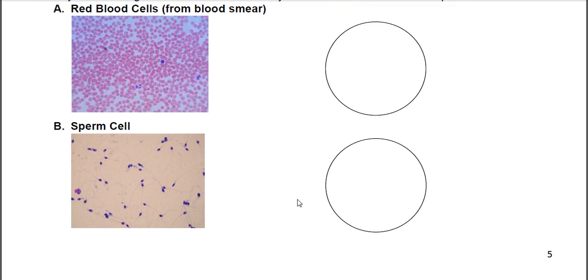Next are sperm cells. What you're looking at here is the purple dots are the main body of a cell, and then you see a long flagella coming off. The function of the sperm cell is to fertilize an egg of the reproductive system. The special features are the flagella. These are the only cells in a human that are able to swim.